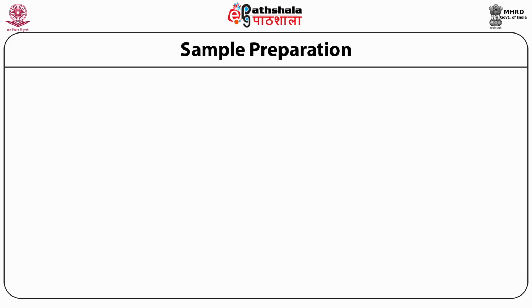The sample preparation. It is the most important part of preparing a sample for proper analysis using EDAX. This means what all parameters one must keep in mind while preparing the samples. So, while preparing the samples, the following points must be kept in mind.